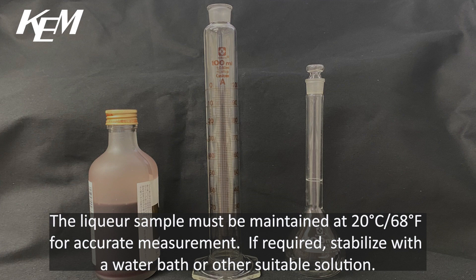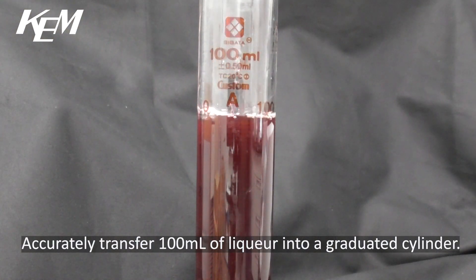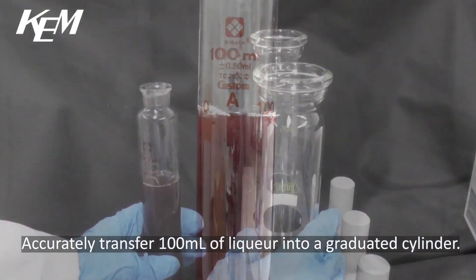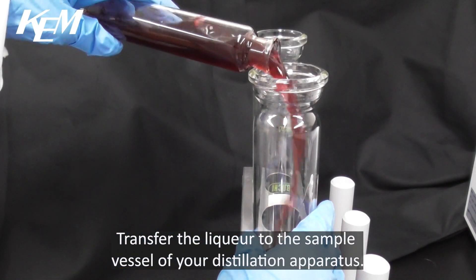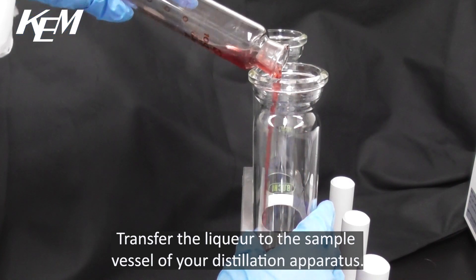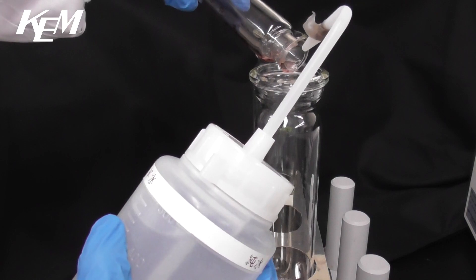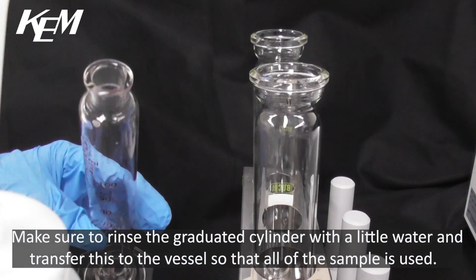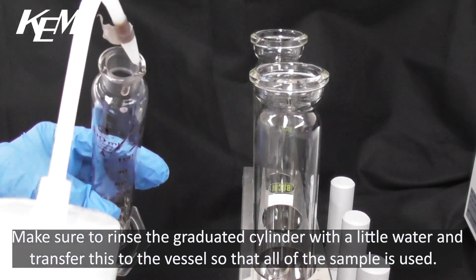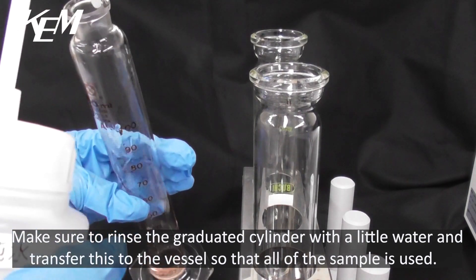If required, stabilise with a water bath or other suitable solution. Accurately transfer 100ml of liqueur into a graduated cylinder, then transfer the liqueur to the sample vessel of your distillation apparatus. Make sure to rinse the graduated cylinder with a little water and transfer this to the vessel so that all of the sample is used.